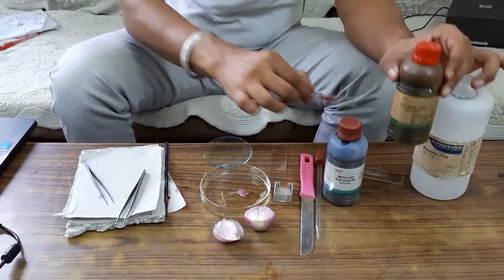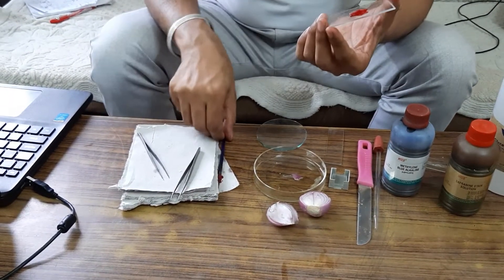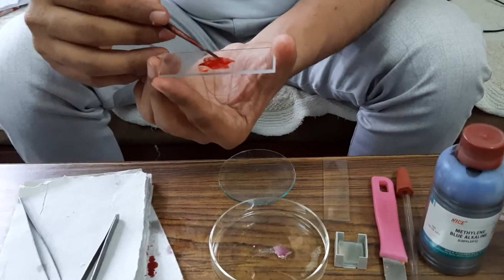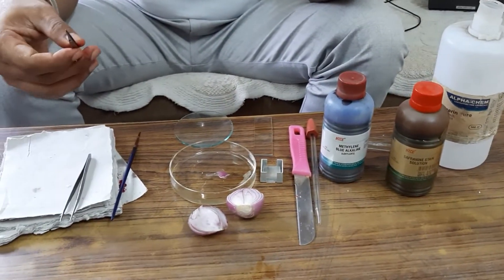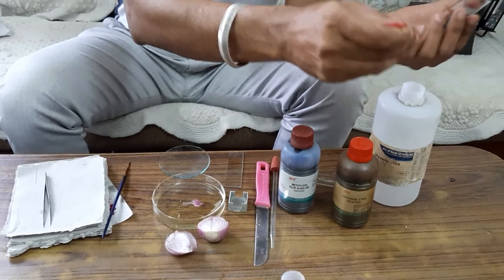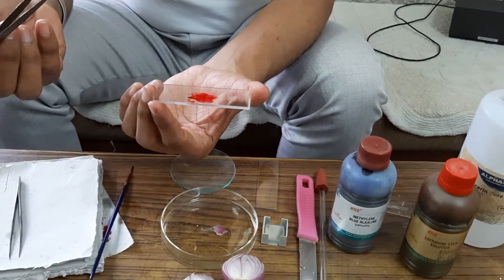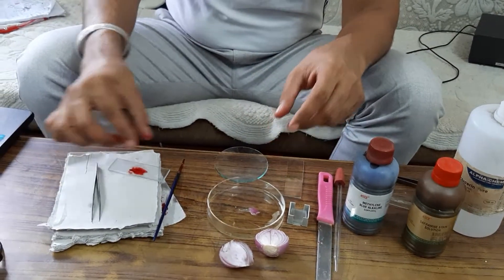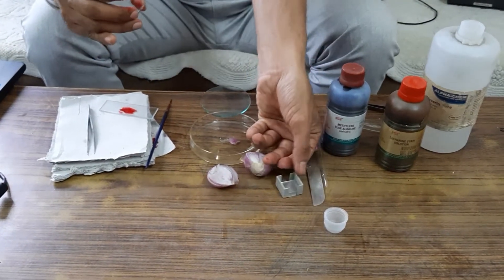I have already stained one onion peel — using the brush I have stained it. The next step is to put a drop of glycerin using a brush or forceps to prevent drying the material.